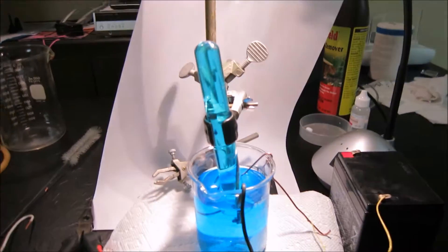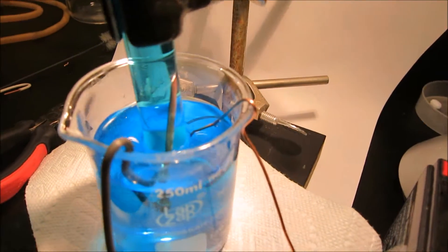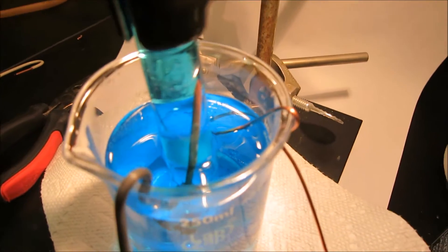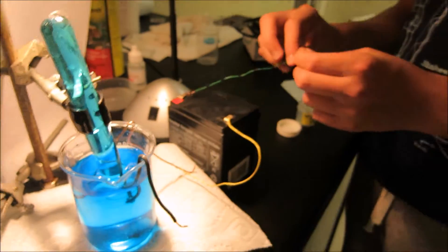We have our setup ready. We have two electrodes: one is an iron nail, the other is a piece of copper wire. The iron nail will be connected to the positive terminal and the copper wire will be connected to the negative.